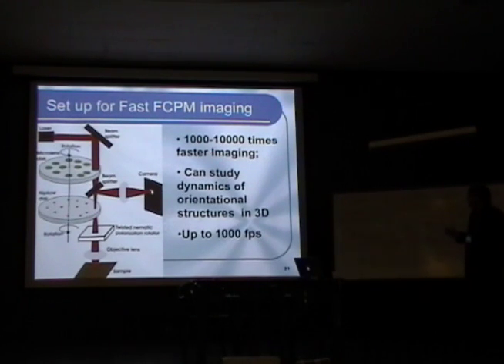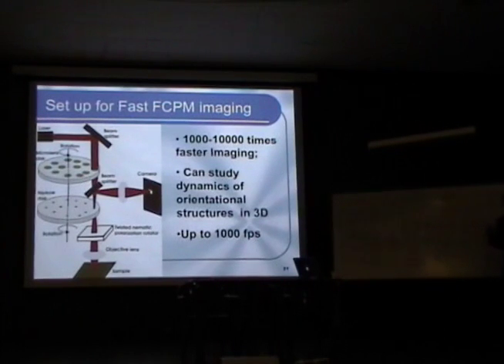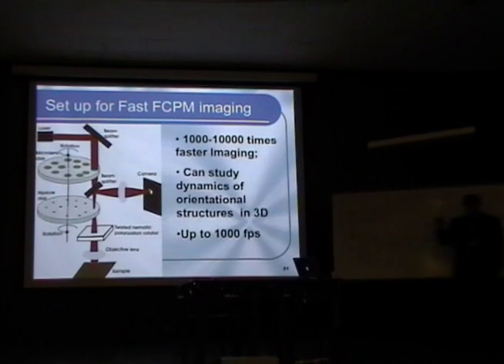So one approach which allows fast confocal imaging at much faster rates is to utilize the so-called Nipkow disk. The setup for such an imaging approach is shown here. It basically consists of two coupled disks, the Nipkow disk and a disk of microlenses, which spin together, being coupled mechanically, in such a way that the sample is illuminated by thousands of beams at the same time.